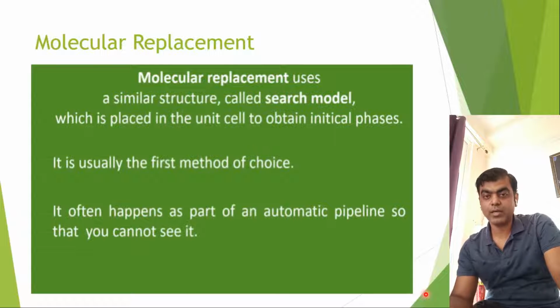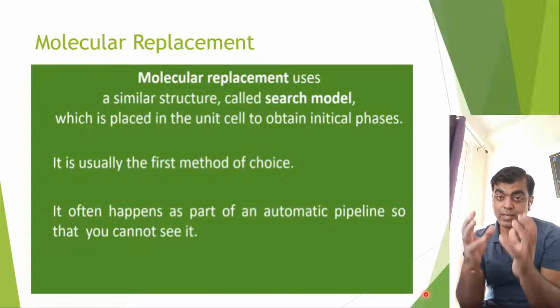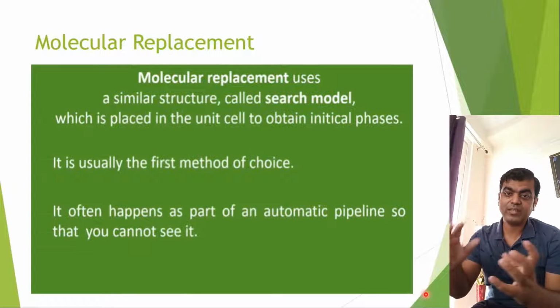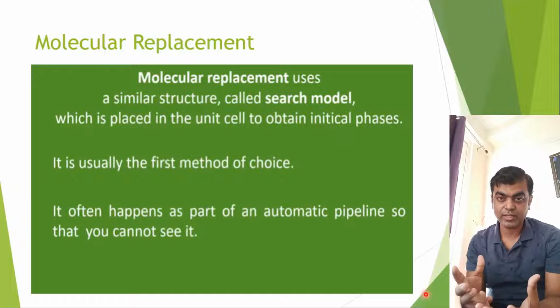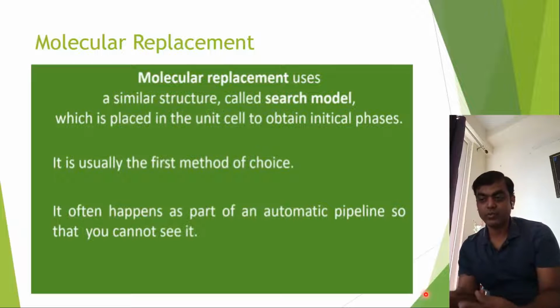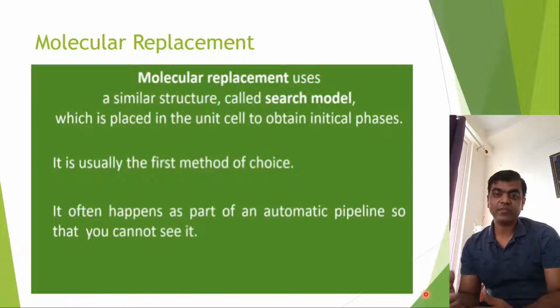So the search model, suppose you are predicting a model, right? You search it with a very close looking model in terms of structure, and then you try to match with it. So a similar structure, in the form of a search model.